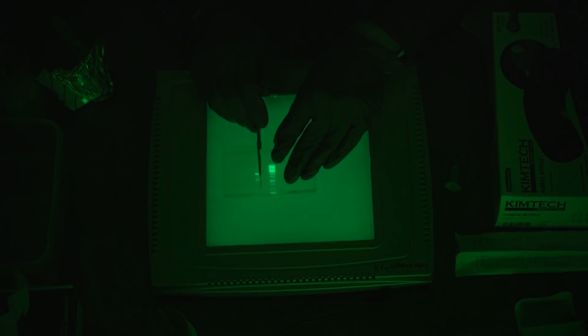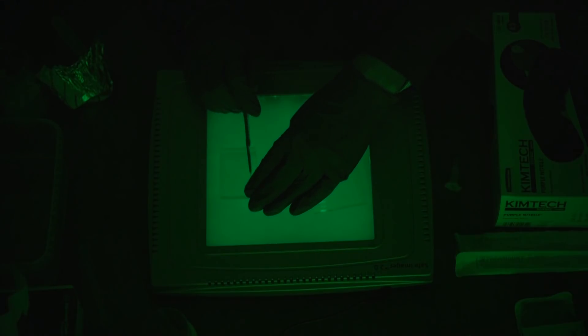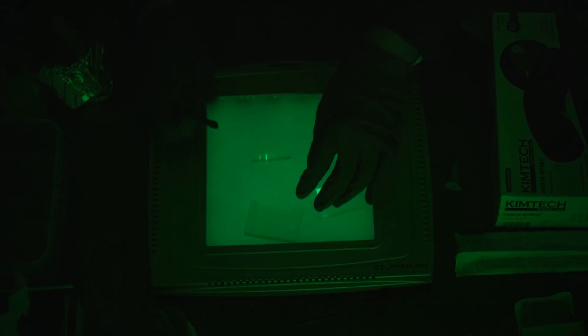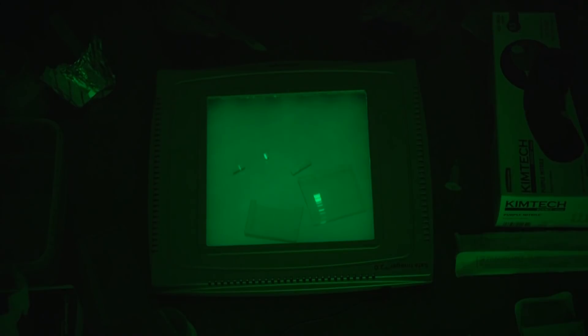First cut, just to one side of the band that I'm trying to isolate, and then we remove the unwanted piece of the gel. Now that I've separated the gel, it's very important that I remember which of the two bands I want, because without the ladder there for association, I won't be able to tell which band is larger and which is smaller. Second cut just to the right. Third cut just above the DNA fragment that I'm isolating, and fourth cut just below the fragment that I'm isolating.